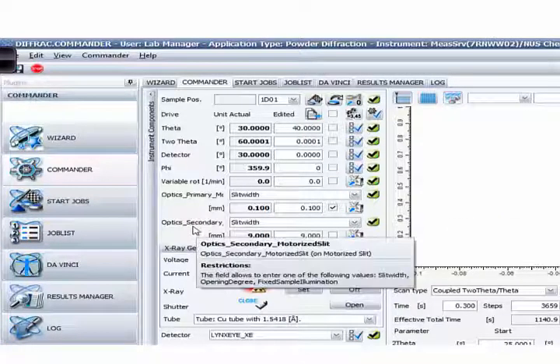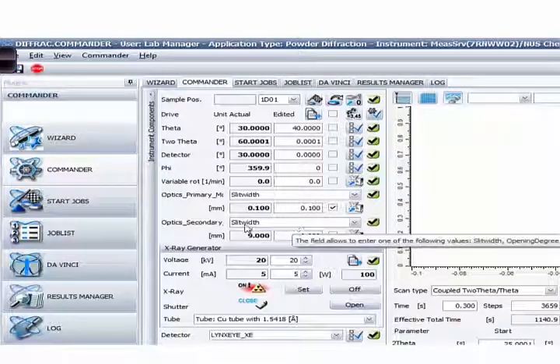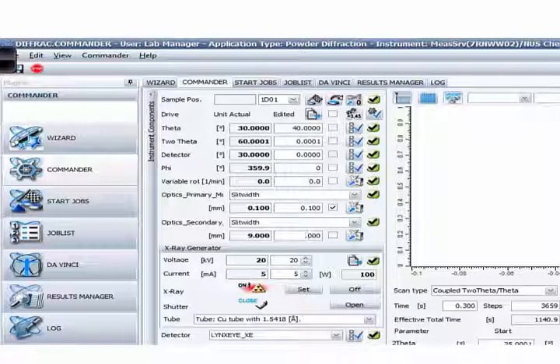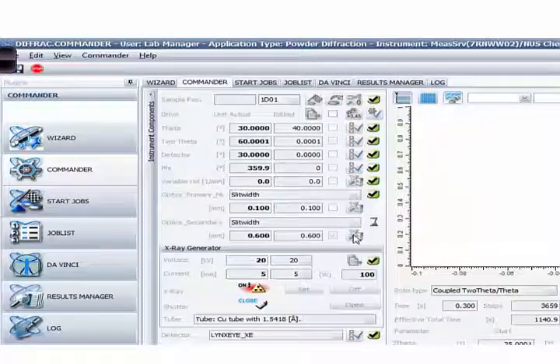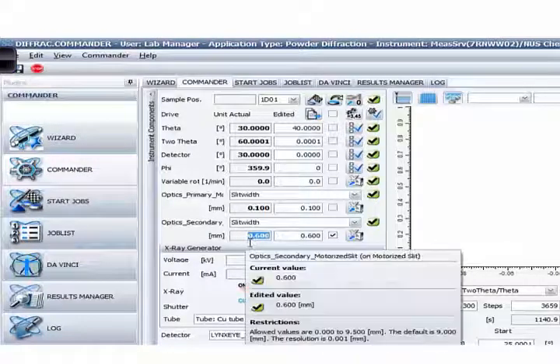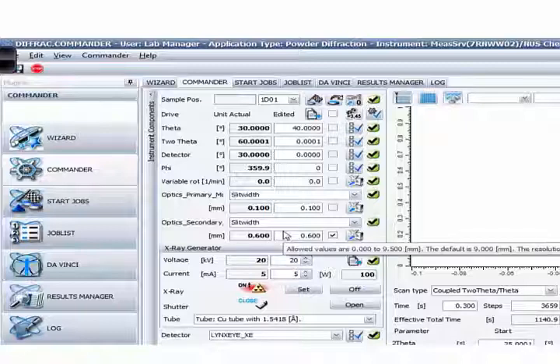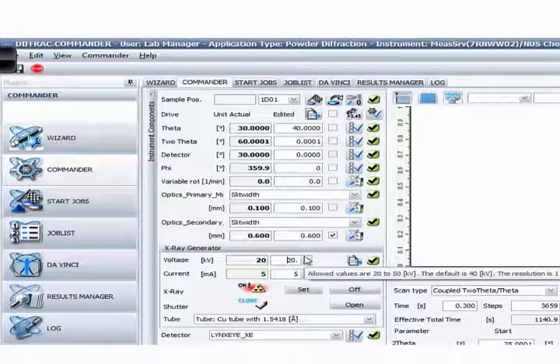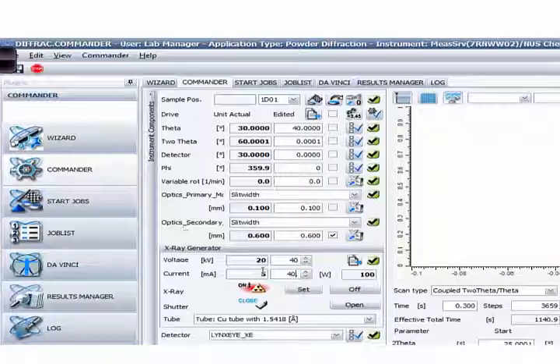The same goes for the secondary optic box — it also uses a motorized slit and is currently fully open at 9 mm. If you need to change it, for example to 0.6, check the box and send changes to the instrument. When it gives a green tick, you can see it's showing 0.6 in the left-hand column. Then you can go on to the voltage and current — same approach: right-hand side to key in, left-hand side showing current setting. I'll set 40 kV and 40 mA and press the Set button.